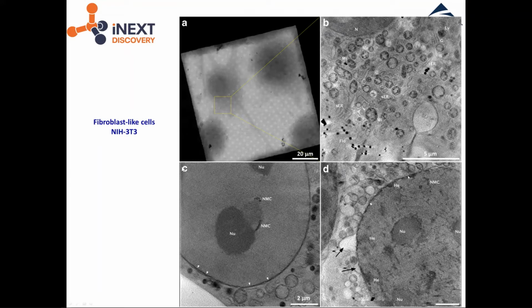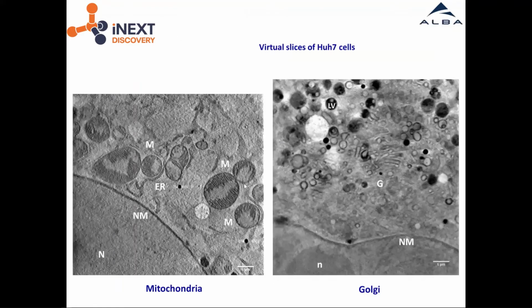Then on the C image here, you have again the nucleus with the double nuclear membrane, the pores, the nucleoli, nuclear channels. On the right bottom corner, you can see that there is blebbing of the nuclear membrane. The heterochromatin, because it's more packed than the euchromatin, will appear denser than the rest, than the euchromatin. And this is the typical images we are having.